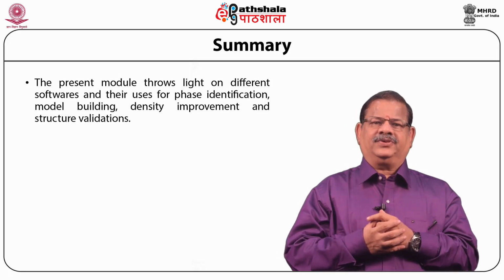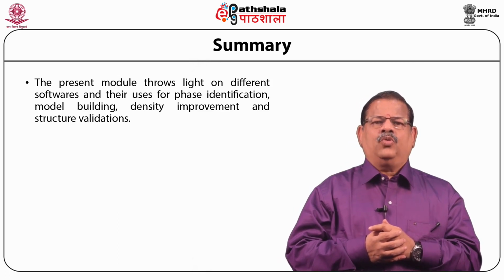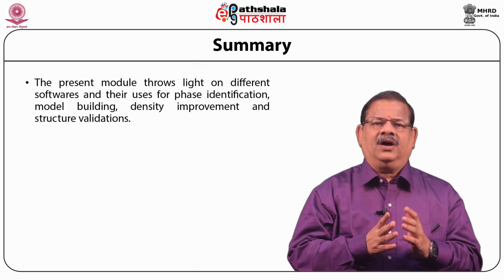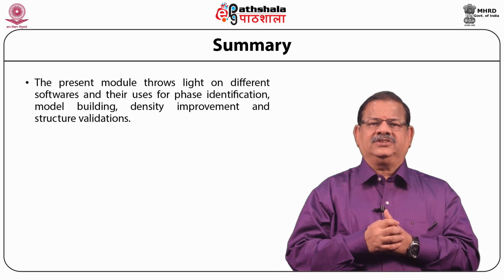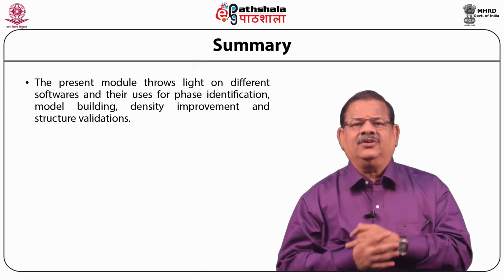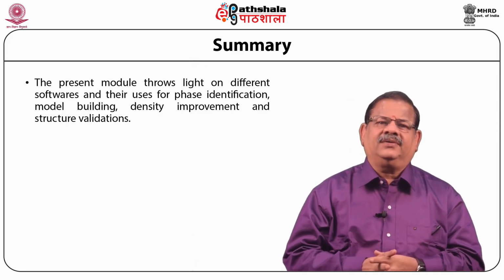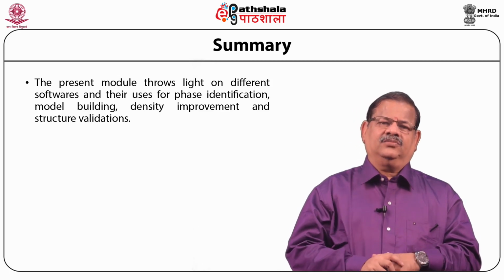the same purpose. And also we have seen 2 other packages. One is the PHENIX suite of programs. In PHENIX, there are two modules, solve and resolve. Solve uses the heavy atom positions located from the anomalous scattering data, and resolve uses them for phasing and doing your modeling business. So it is separately available, and also it is contained in the PHENIX suite, which also has some other programs other than these modules.